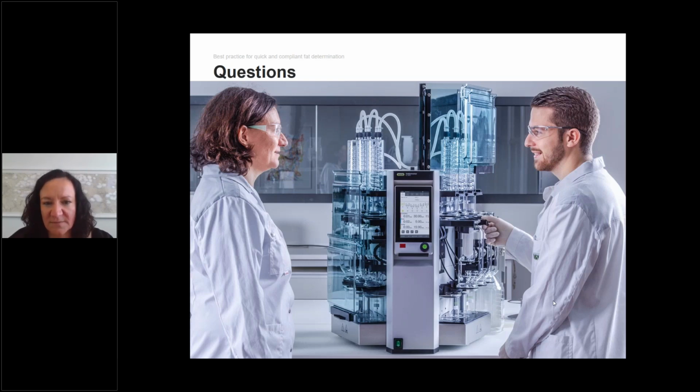For hot extraction, you have very short extraction time, so the benefit is not the same as for the Soxhlet or for the ECE. The only thing, and this is valid for all instruments, is that it prevents user error, so you will not be able to start an extraction without a beaker present or with an empty beaker present. So this is prevented by this analyte protection sensor, to reduce user handling errors.